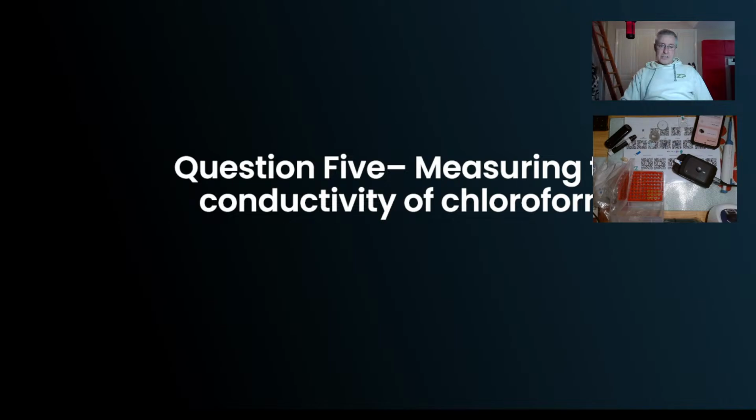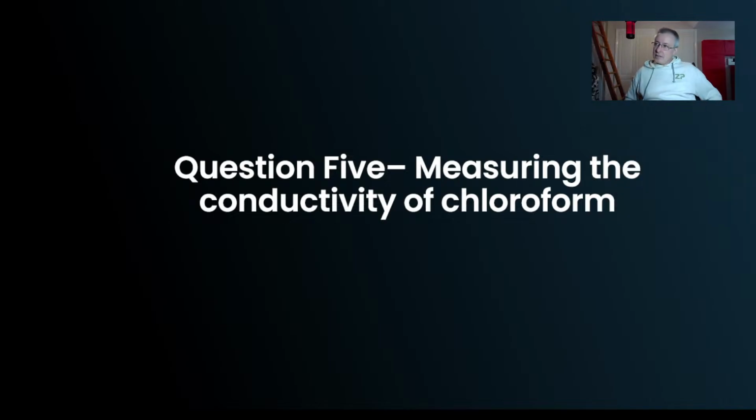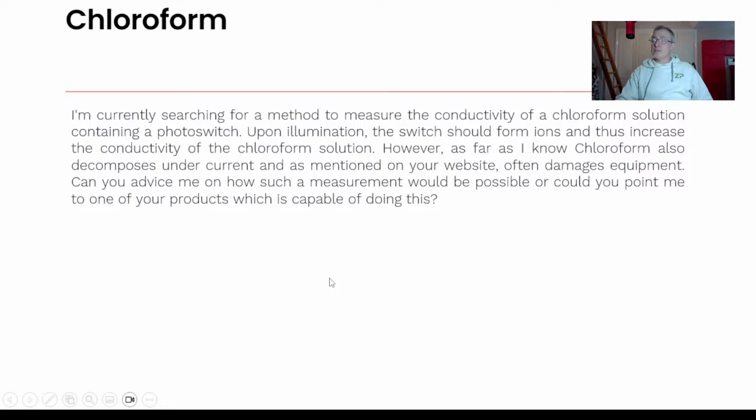Now, this is an interesting question. Somebody wants to measure, I say here, the conductivity of chloroform, and that's slightly miswritten. They have an organic molecule that's in chloroform. They're going to illuminate it with some light, and in doing so, the organic molecule acts like a photo switch. It ionizes and changes the conductivity of chloroform.